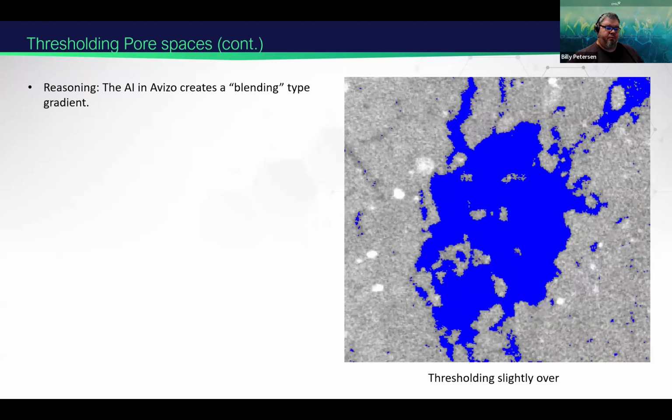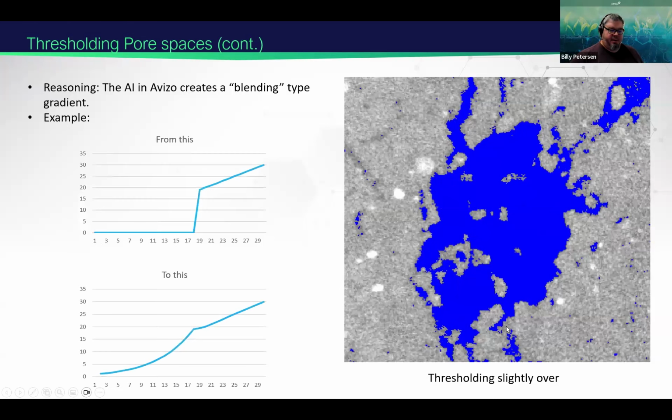Okay, yeah. So reasoning, like I just said, it goes over a gradient based on the rate and the weight of the image, if you will. Why is this thing not going? And here's an example. These aren't real numbers. This is an example of, we have nothing, nothing, nothing, and then all of a sudden soil or matter or mass. It creates a gradient based on the confidence level of what it believes it should be there.